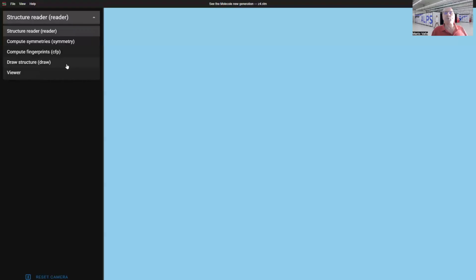You see, when I add a module from the list of available modules, it puts in parentheses the unique ID of this module, simply as a reference, but you can delete it, obviously.